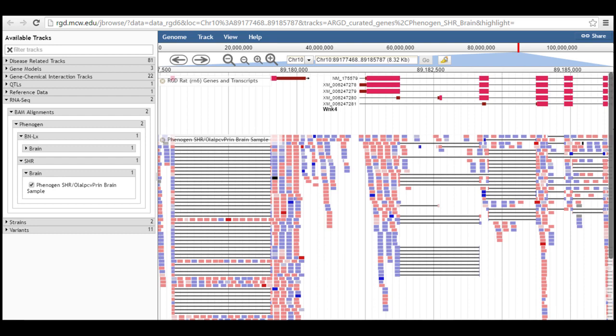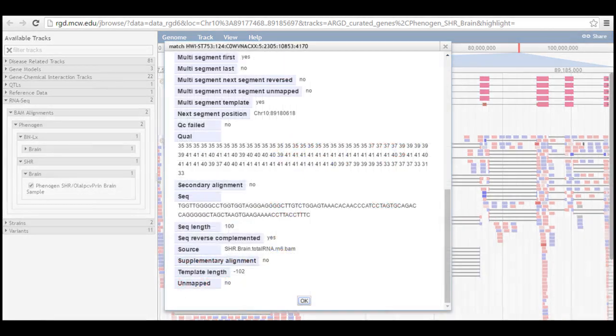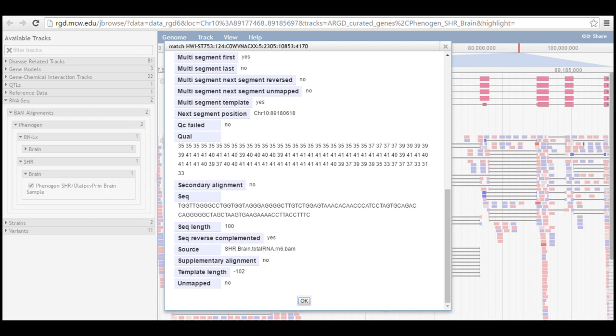Blocks colored red indicate reads that align with the forward strand and those colored blue are aligned to the reverse strand. Clicking on an individual block opens up a pop-up with alignment data for that specific red.